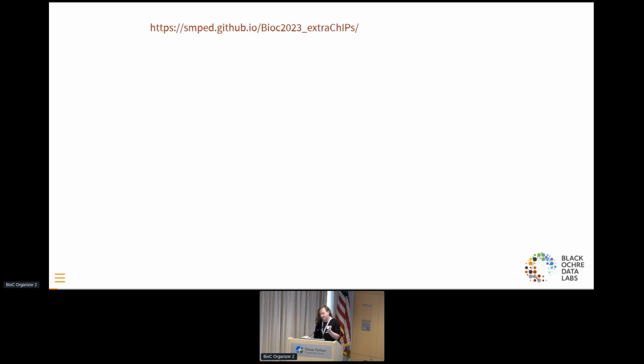There was some data which I have provided, and all the links are in that workflow, because with ChIP-Seq you actually need data, and I have not been smart enough to organise an ExperimentHub object yet. Eventually I will get to that, but I haven't managed it yet.